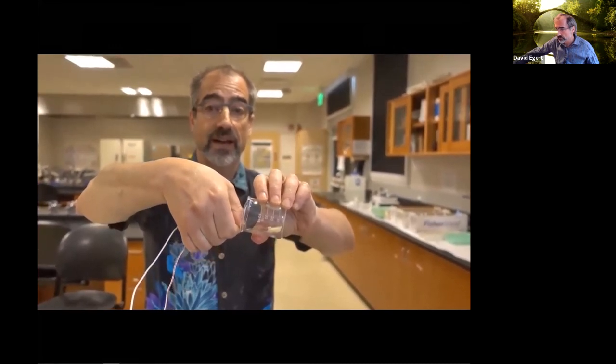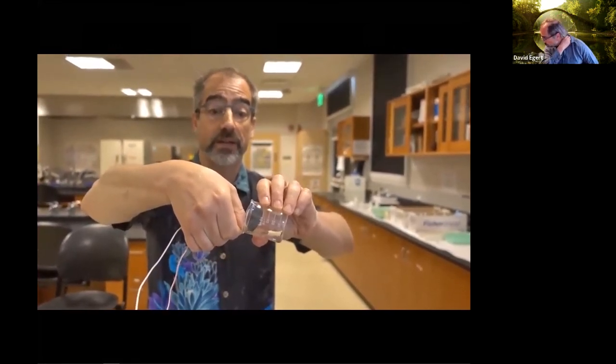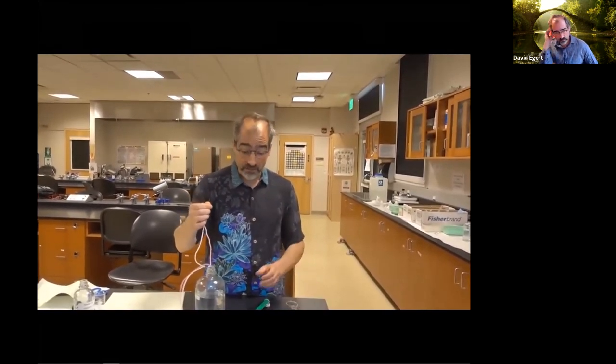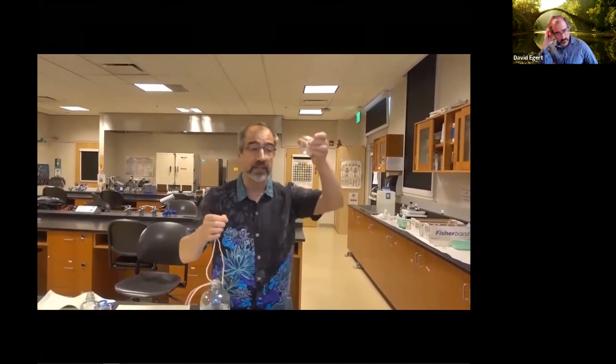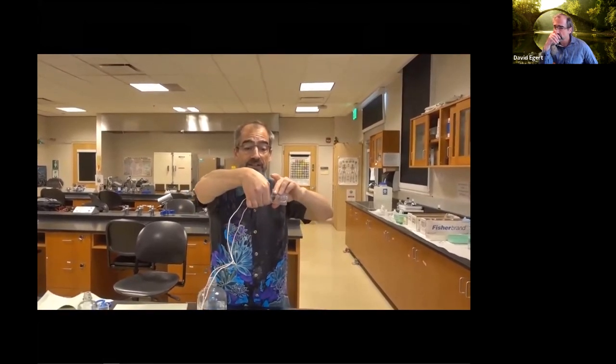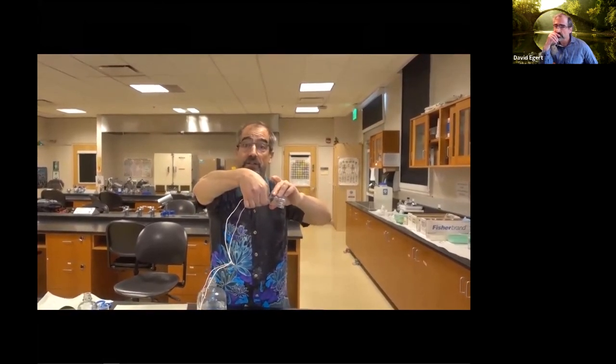And I don't hear anything. So that's telling me something about the electrical conduction of sugar water. And again, if you remember, the sodium chloride looks physically exactly the same, but if I put the wires in there, it's a very different response.